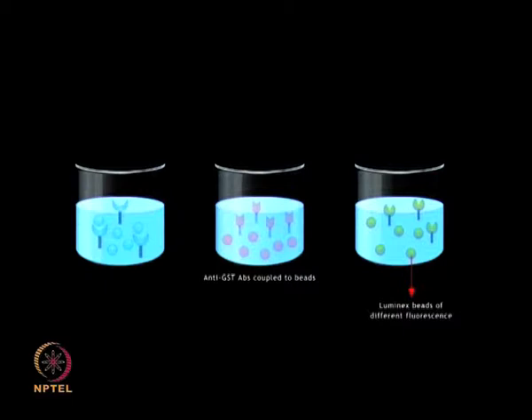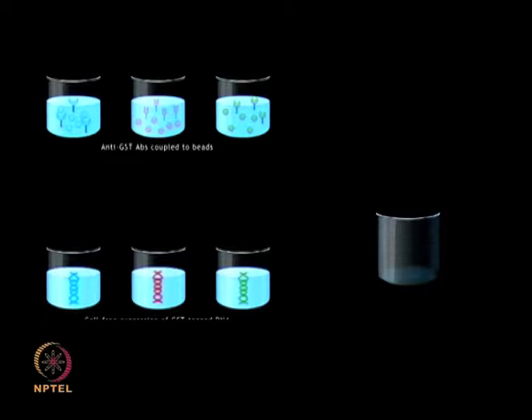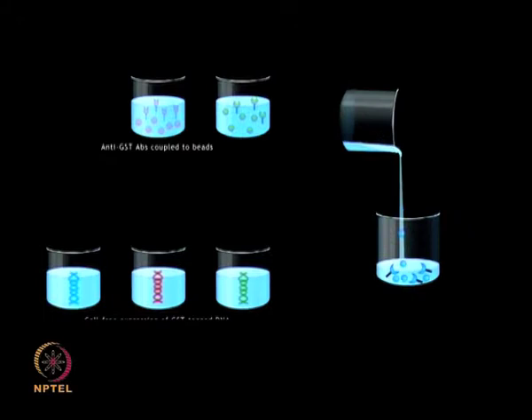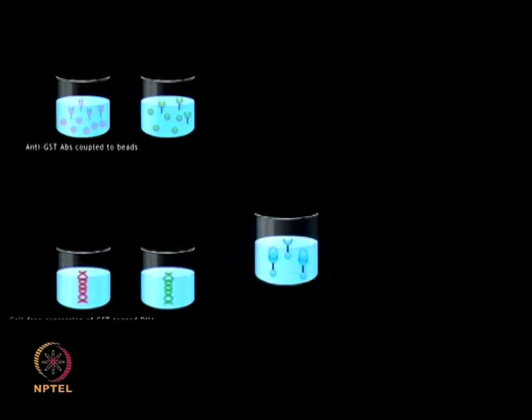We will now look at another application, rapid bead based assay for multiplexed detection of antibodies to EBNA1 and P53, study by Wong et al. 2009. In this study, authors developed a programmable multiplexed immunoassay where tagged antigens were expressed by using in vitro transcription and translation, and captured these onto the anti-tag coated beads.